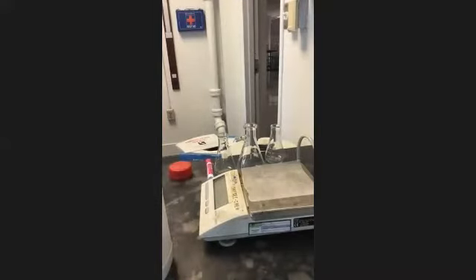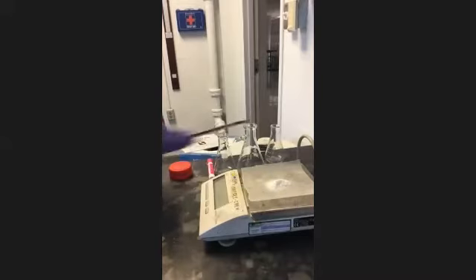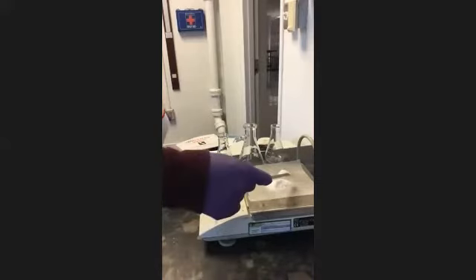All right. So you're gonna weigh this out with a scoopula. And of course, if you took chemistry already, you should know you always got to zero this thing out. So we're gonna zero it out, and then we're gonna weigh out 6.9 grams. All right, we had 3.62, so I can kind of gauge and see how much I need.